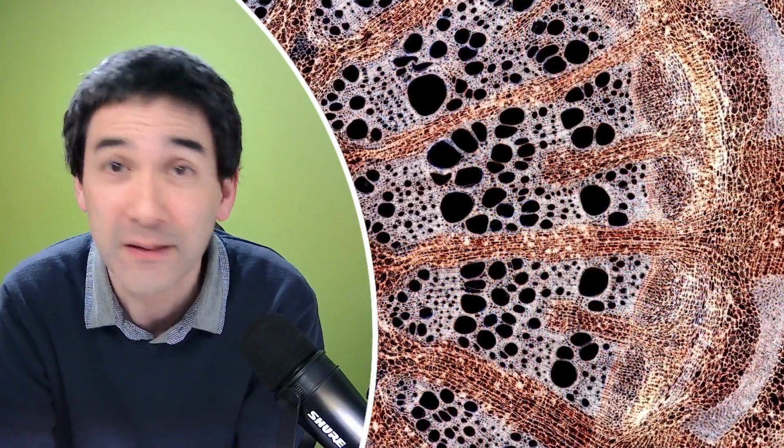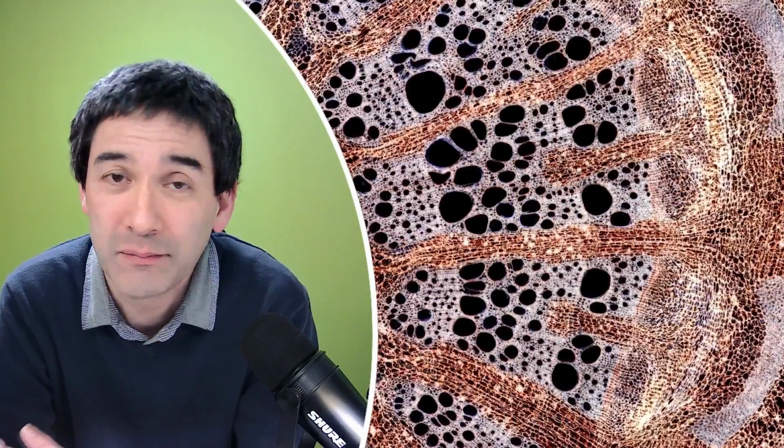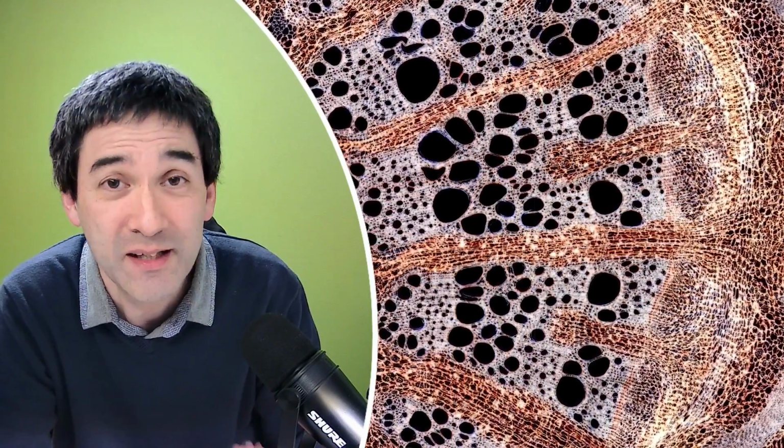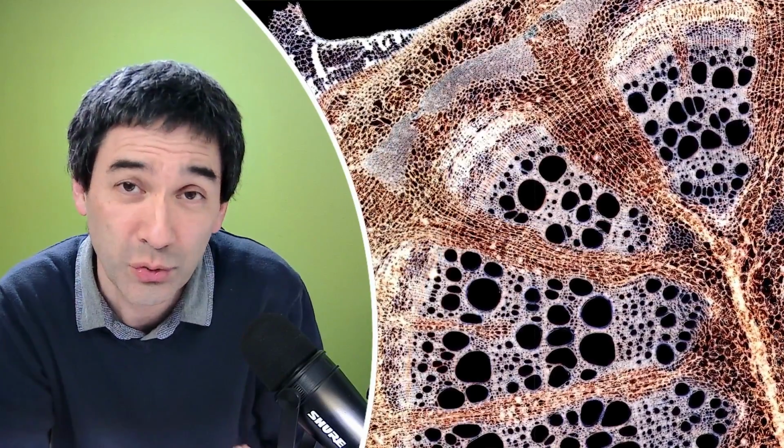But in most cases, actually in almost all cases, the specimens that I'm observing are really completely harmless. I don't know, cross-sections of plant leaves, for example. There's really nothing dangerous about those, right? And for this reason, it really depends a lot on what you're observing and how those slides and cover glasses have become contaminated. But even if there is nothing dangerous on there, of course, there's always the risk that you cut yourself and injure yourself, which you don't want to do.